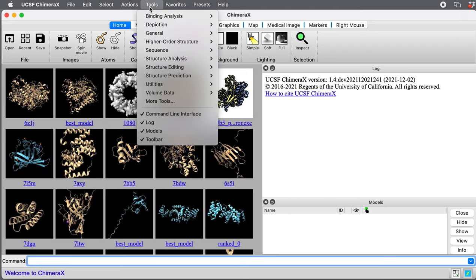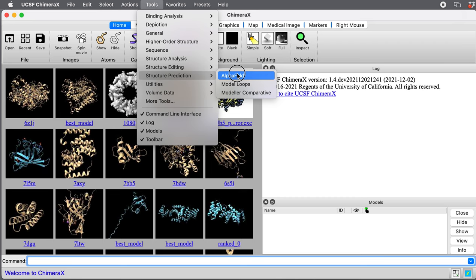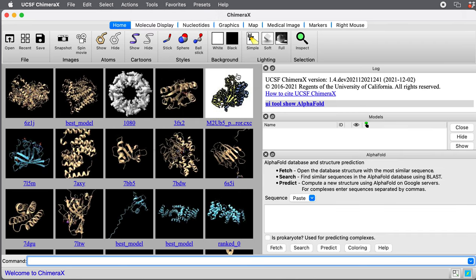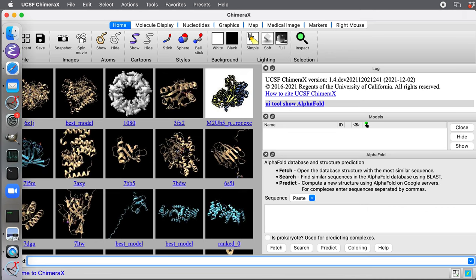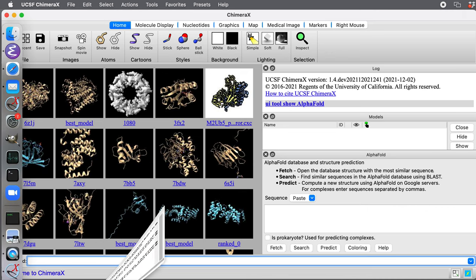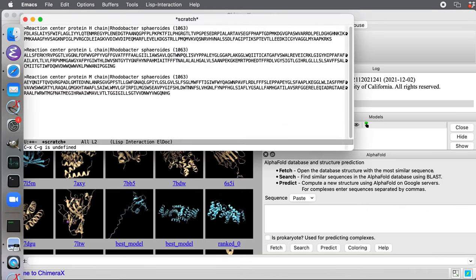We'll go to Chimera X menu Tools, Structure Prediction, AlphaFold, and it brings up this panel. We're going to paste in the three sequences of the three protein structures.